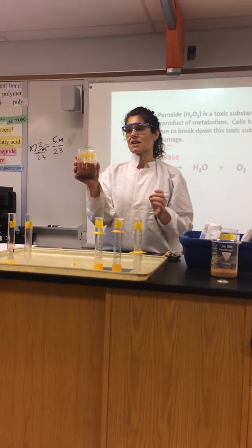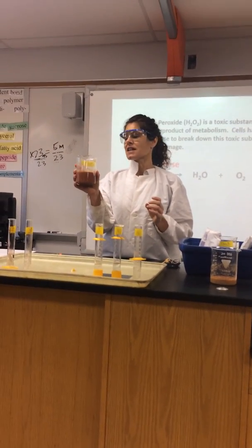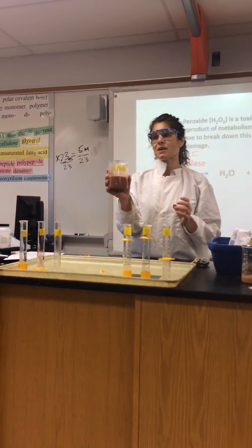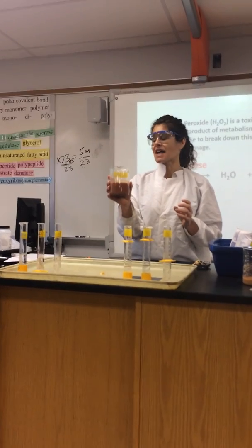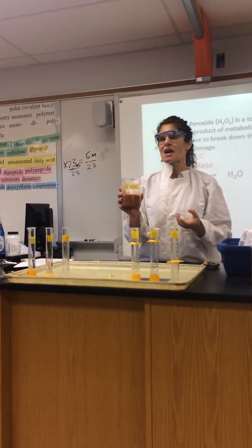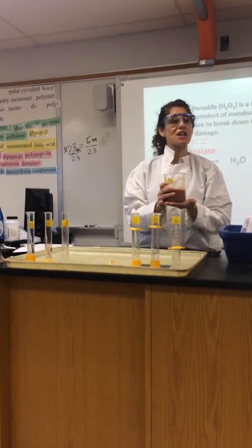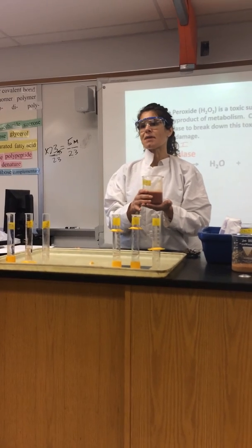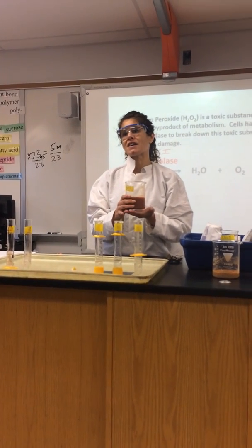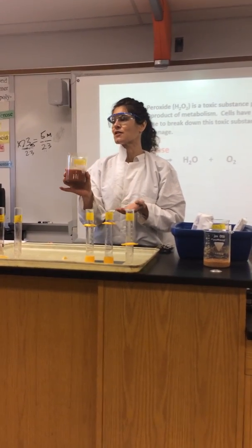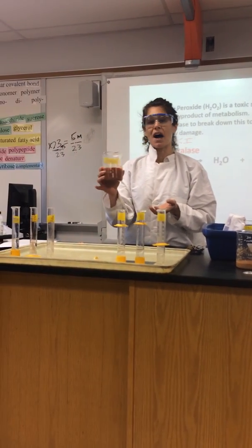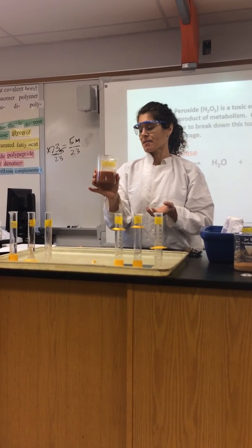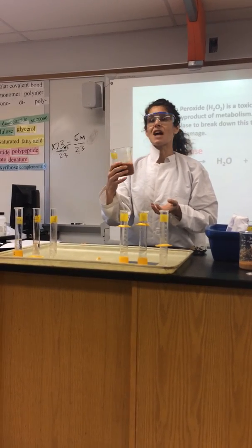What we have in these beakers is liver that has been ground up with some deionized water. It was a little bit gross, but liver is really good to use because the enzyme catalase would be found in high concentration in the liver, because the liver's job in your body is to break down toxins.